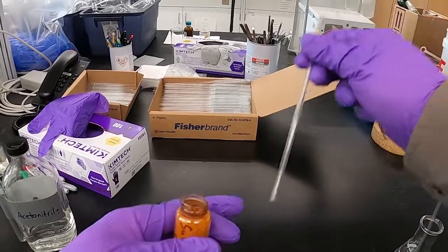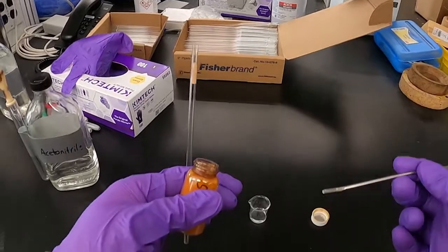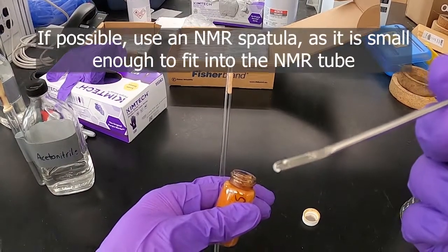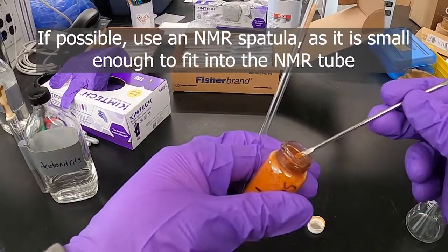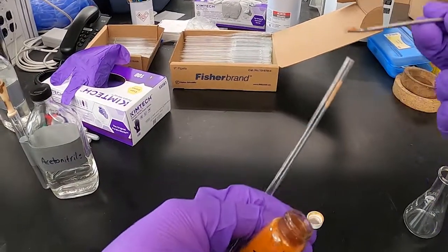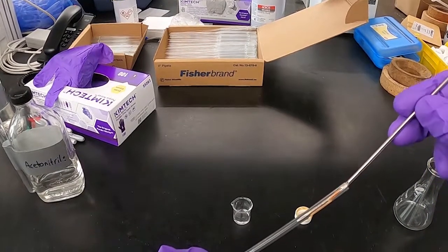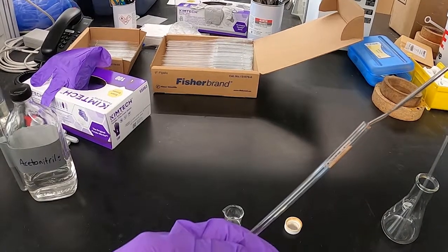So if we're making an NMR sample with a solid, one way that you can transfer that — probably the most effective — is these really thin spatulas that are actually kind of designed for NMR tubes. They have a little trough in them. If you get about that much, it's pretty easy to get it into the NMR tube, depending on how static-y or wet your solid is.